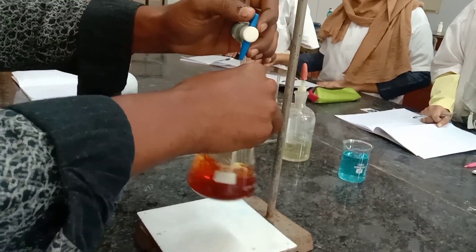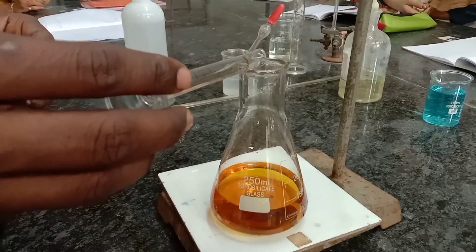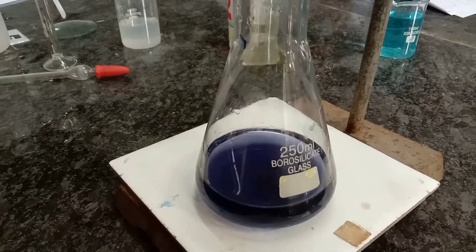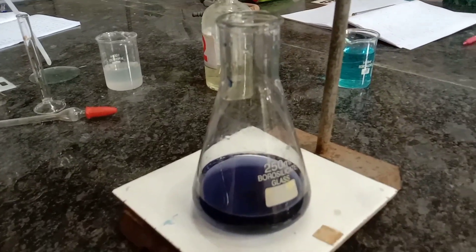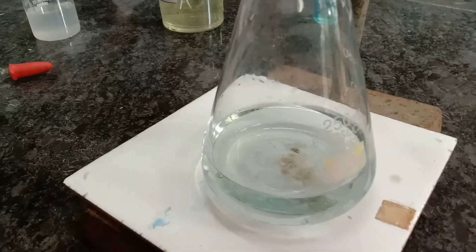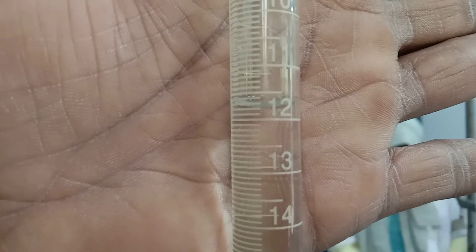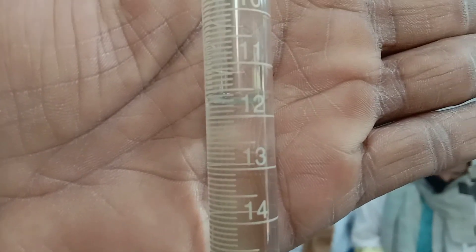Stop the titration when the color of the solution changes to greenish yellow. Then add the indicator — 1 ml of starch. Once the dark blue color is obtained after adding starch, continue the titration with hypo until it turns colorless. That is the end point. The solution has turned from dark blue to colorless. Note the burette reading: the lower meniscus touches 11.8 ml — volume of hypo is 11.8.